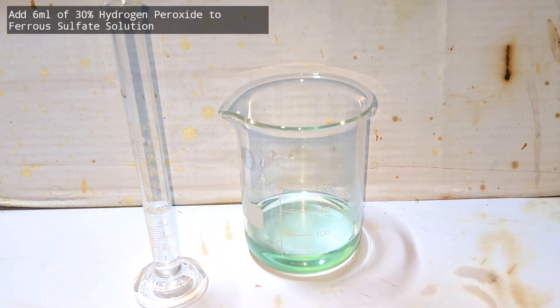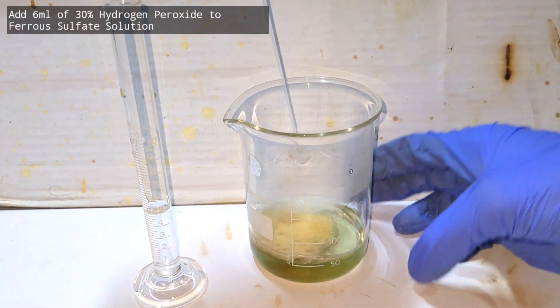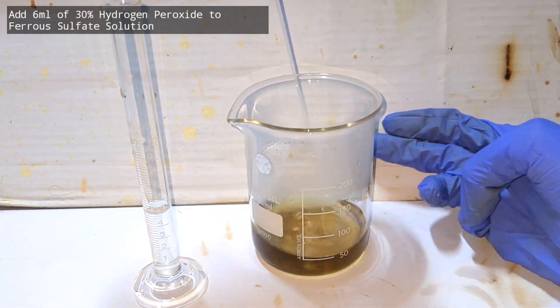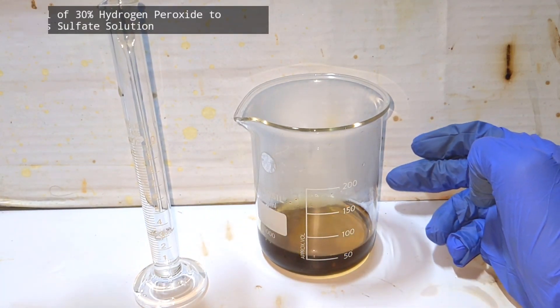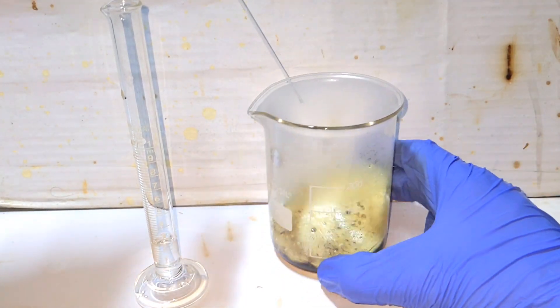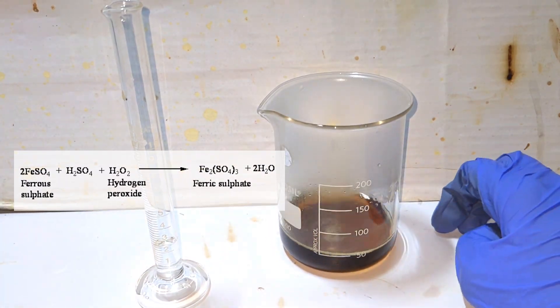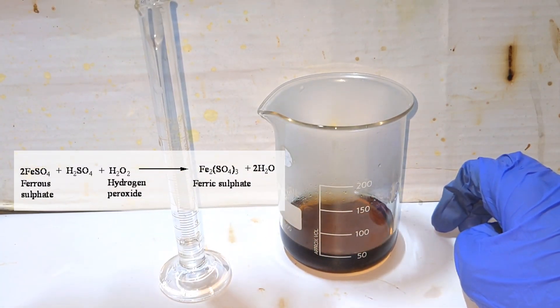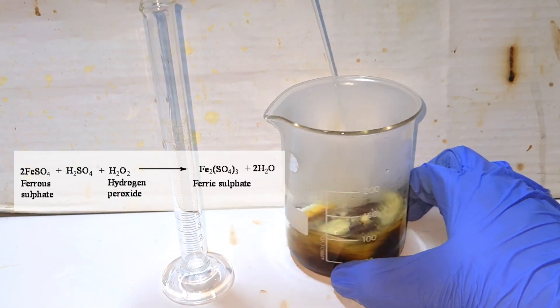Now we bring the 30% hydrogen peroxide and start adding it to the ferrous sulfate solution using a glass dropper, adding it very slowly. You can notice a vigorous reaction taking place and the color of the solution is turning darker and darker. Here the hydrogen peroxide oxidizes iron(II) sulfate to iron(III) sulfate — ferric sulfate — and itself gets reduced to form water.